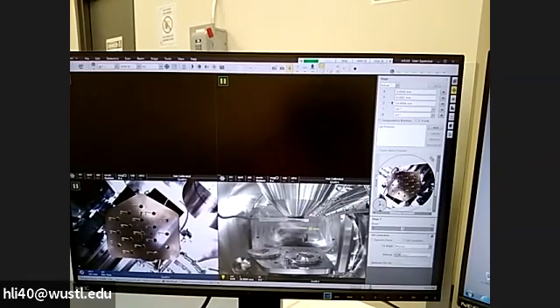So now, if we look at it, 30 is still far away, we can move up more. You can add another 10 millimeter. If your sample is, for example, flat metal stuff and doesn't have much height, we can normally go to 50 without trouble. But again, if you're not sure, you type a smaller number. So now from 30, we want to drive to 50, so put 50 here. This is an actual value, so it's not relative.